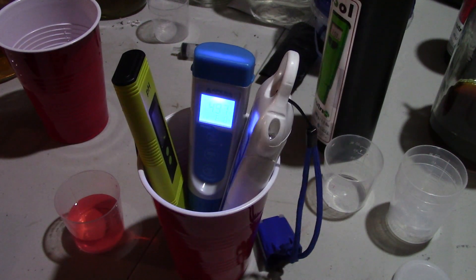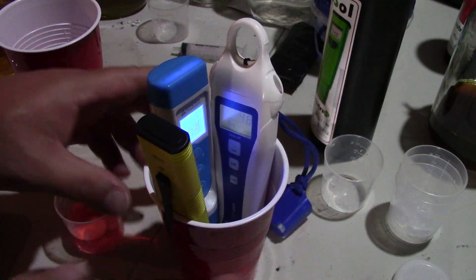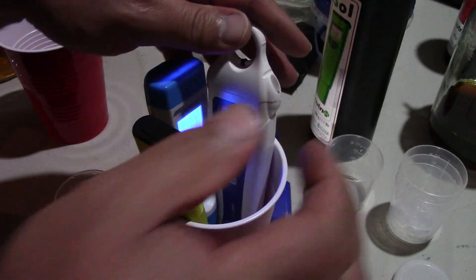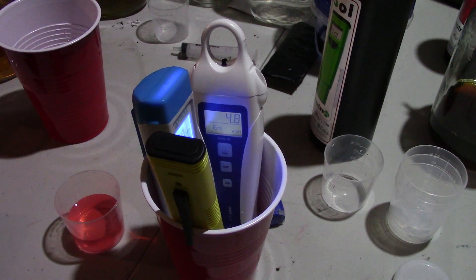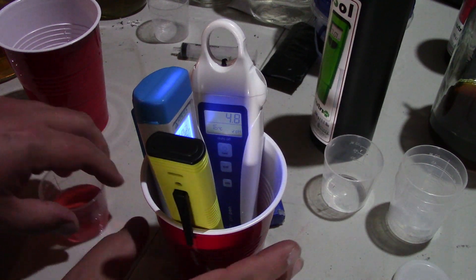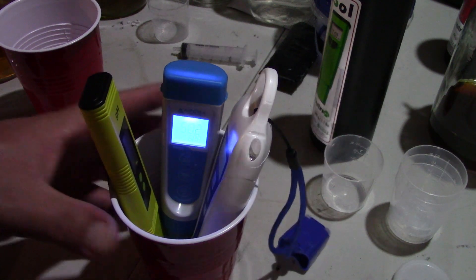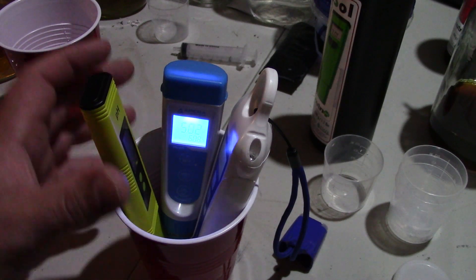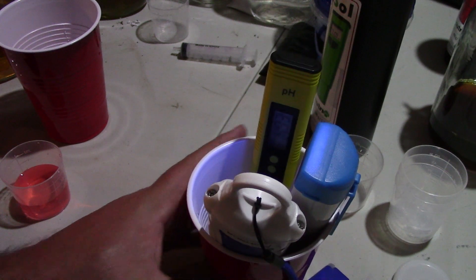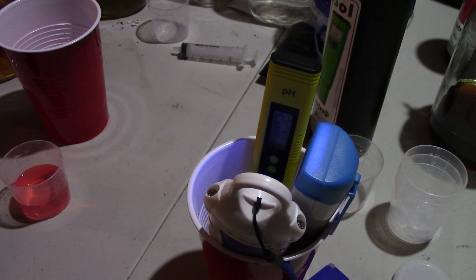For the Aphria, what are we looking at here? It's stable out at 4.95-ish — 4.9, 4.99, 5. This one's over here at 4.8. So 4.8, I mean it could be 4.89, but that's that one decimal thing, right? This one's gone up — still climbing a little bit here, 5.02. And then what is the cheap one at? 4.9, no, 4.92.